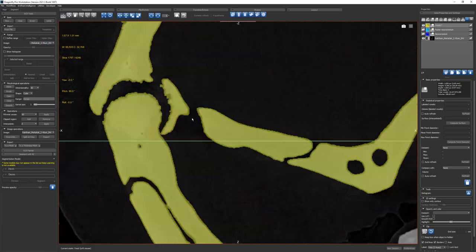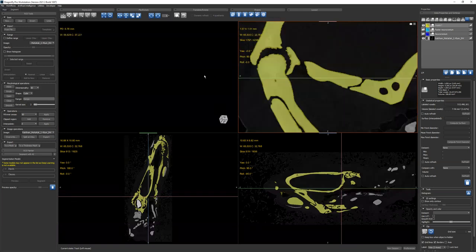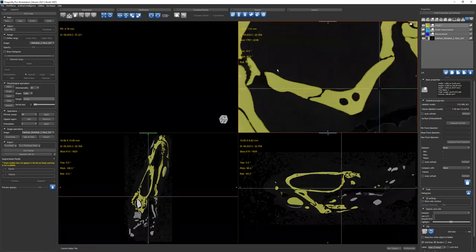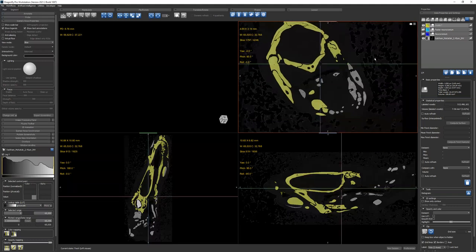But once you've done that, once you've cleaned that up and you're ready to go, you have your edges. They're not just the edges of the bone, but just a little bit beyond it. So you have that histogram that goes from black to white. When you've done that, you want to create a volume that is just your segmentation.